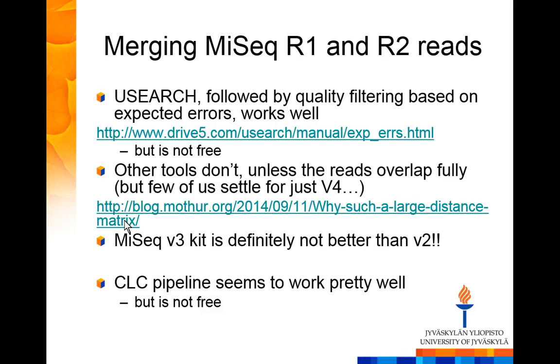For MiSeq data, one of the big challenges nowadays seems to be merging the two reads. This very elemental first step that should work automatically apparently doesn't.